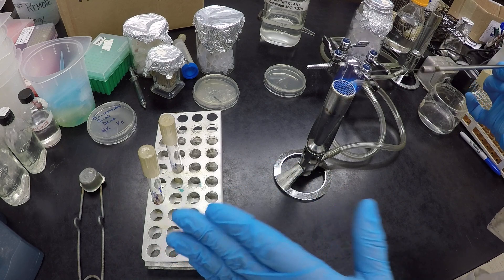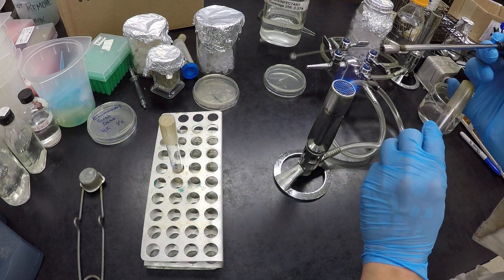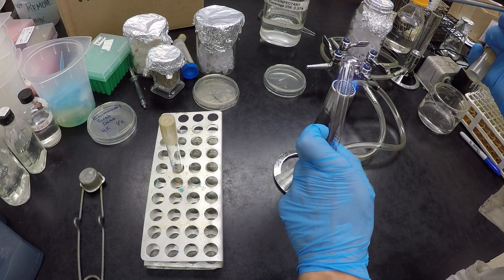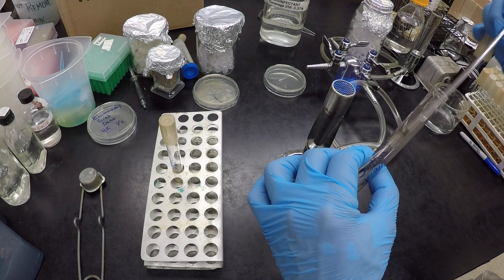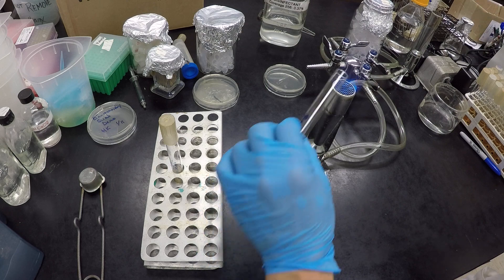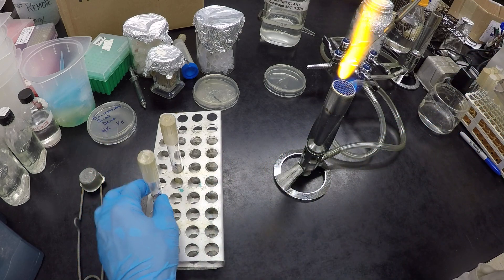And now I'm going to grab my sterile broth, my sterile TSB. Again, grip it with the pinky, twist and turn, flame, insert, a little bit of a shake, flame, close, sterilize, put away.